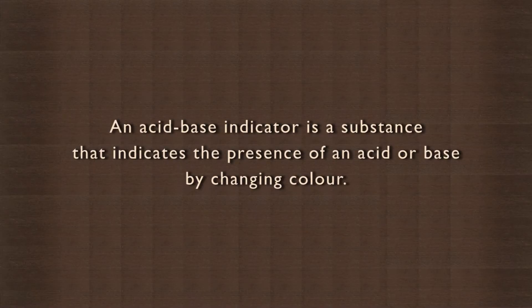An acid base indicator is a substance that indicates the presence of an acid or base by changing color. Today we will learn about an indicator extracted from a vegetable.